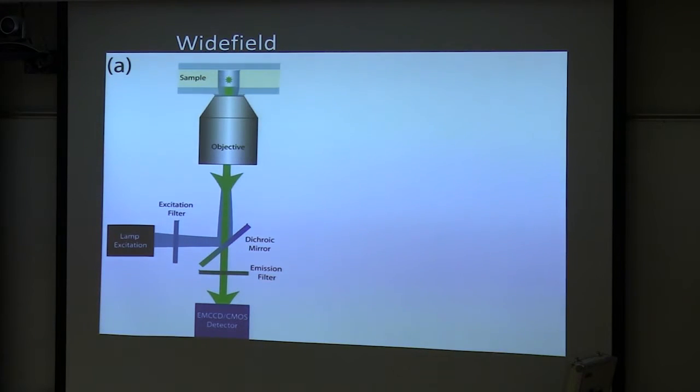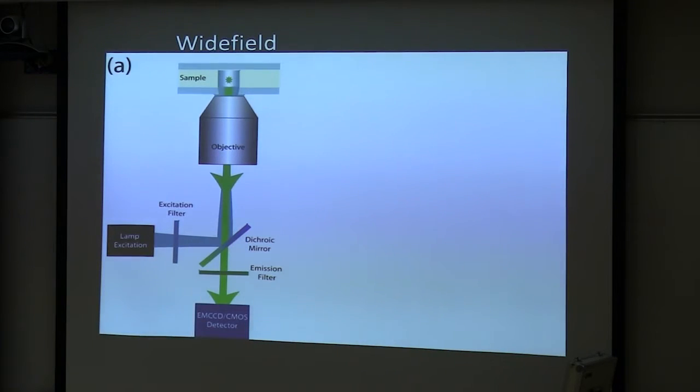So in the past, fluorescence microscopy has definitely arisen as one of the best techniques we have for generating contrast in a sample and also having molecular specificity. So we're able to look at specific molecules in our sample with high resolution and high contrast. And the way we've done that is primarily through 2 microscope techniques.